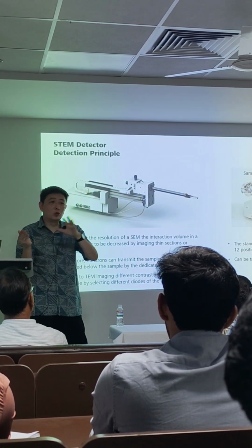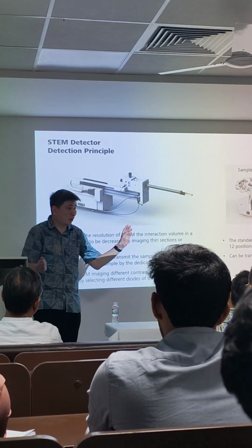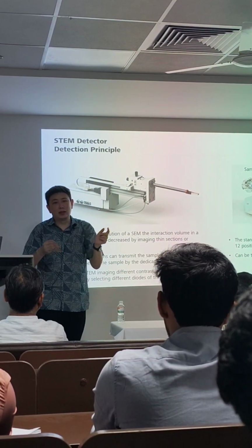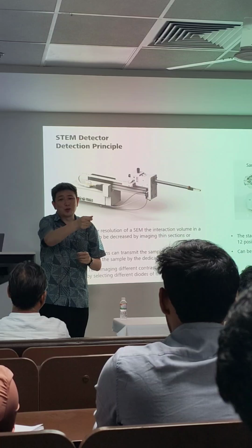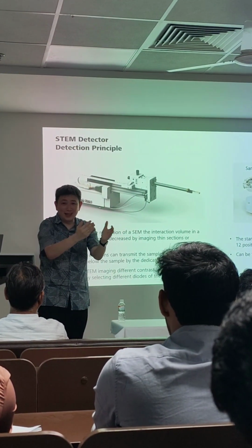And in TEM, you need to do the 2D calibration. If you have used TEM before, you know what I'm trying to say. There's a 2D calibration you do, then you need to find your sample. What if the sample is lost in between? The moment you took it out, gone. You just spent 2 hours to cut the samples, then it's gone.